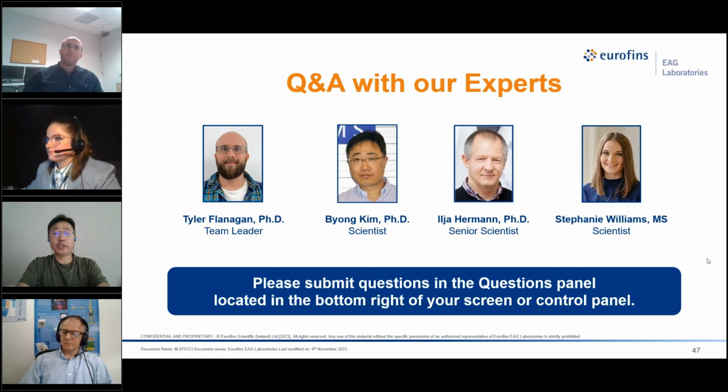Absolute quantification, I think, is challenging. Scanning capacitance will give you capacitance image along with, as I presented, the dopant distribution and the dopant types. We'll probably trace back to approximate those capacitance values using a capacitor. We have two different techniques, something called SCM and the scanning microwave. But I would think absolute quantification is challenging.